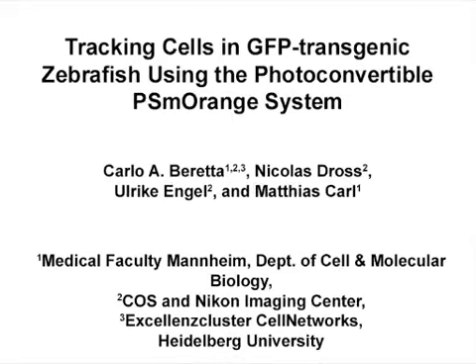The overall goal of the PSmOrange photoconversion technology is to track cells in the living animal during embryonic development and disease. This method can answer key questions in developmental biology, such as uncovering the origin of cells which develop into tissues and organs. The main advantage of this technique is that it can be applied in GFP-transgenic backgrounds. This method can also be applied in different fields of investigation, such as regeneration, tumor progression, and invasion.